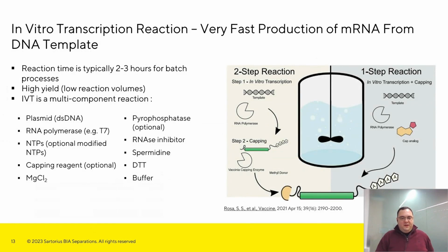Once you have your pDNA linearized, you, of course, move on towards the fun part of the mRNA, which is the IVT reaction. Now, the IVT reaction can be set up in different ways. You can, of course, have a work stream where you have a two-step reaction, where in the first step you synthesize the mRNA, and then post IVT you add the cap.